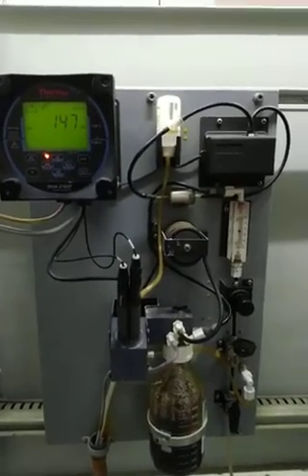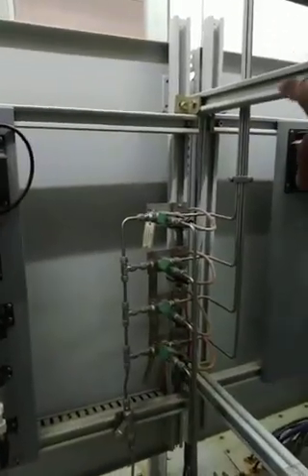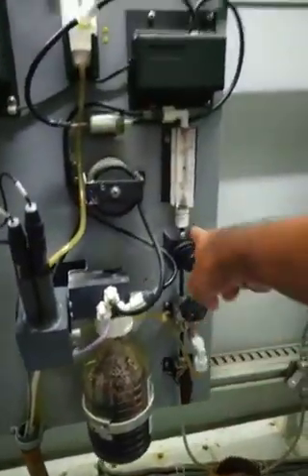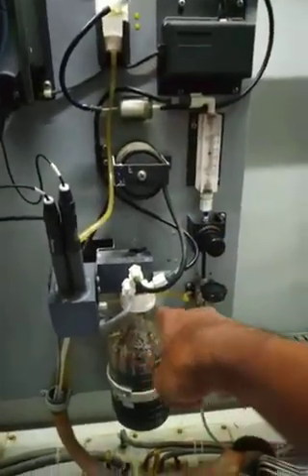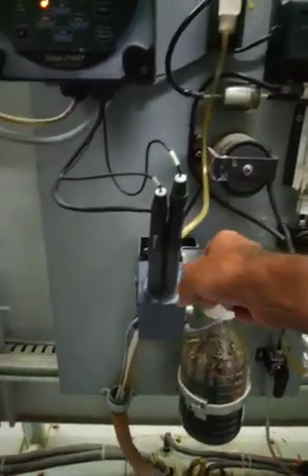This is the whole system of hydrogen. It is one example. The sensor is in the tube — we have the same sensor.